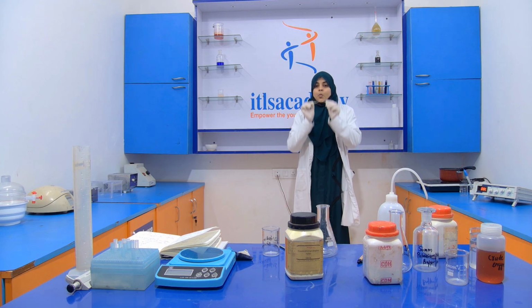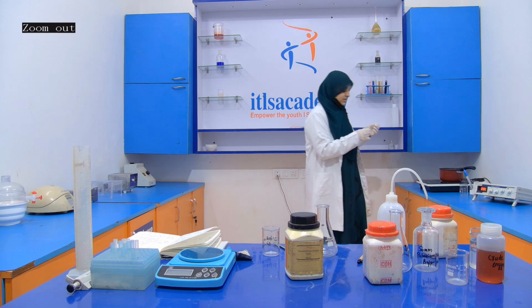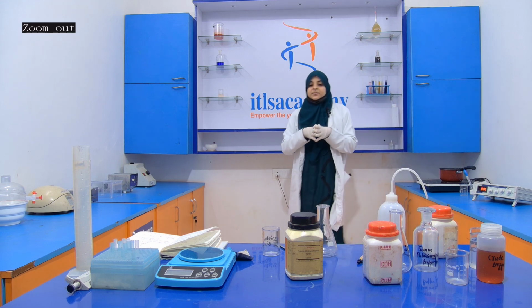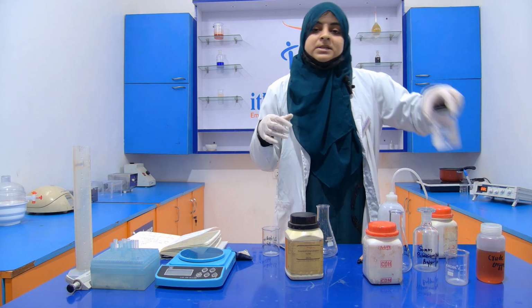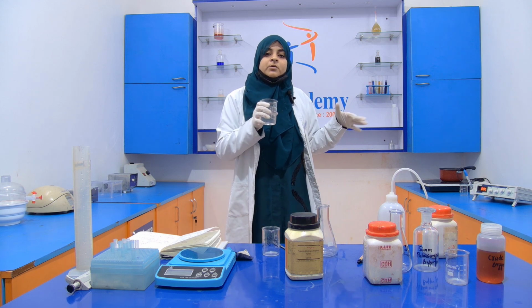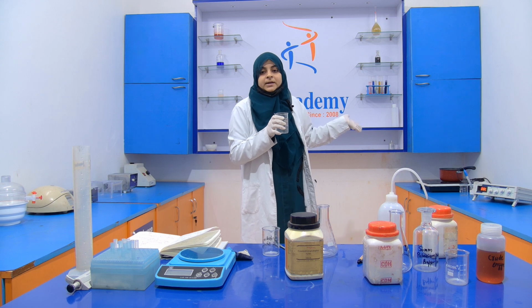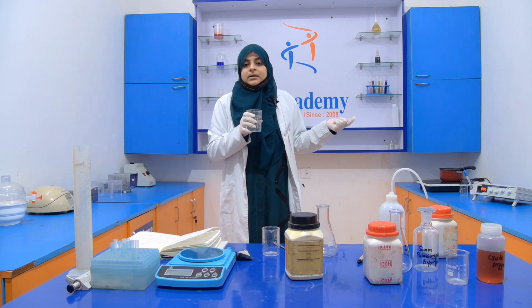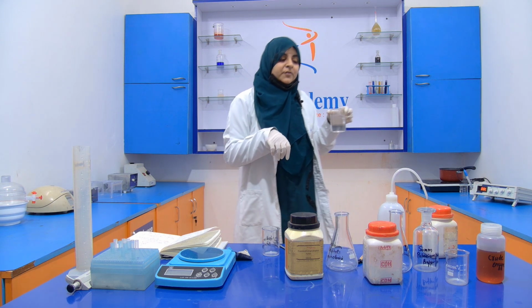So what we have to do, we keep this dialysis membrane inside the boiling water for 10 minutes. Then after 10 minutes, we pour this dialysis membrane inside the 2% sodium bicarbonate, and then again after 10 minutes, we boil it in distilled water. So it takes around 30 minutes for the activation of this dialysis membrane. Then after that, we prepare the buffer. So first of all, we activate it.